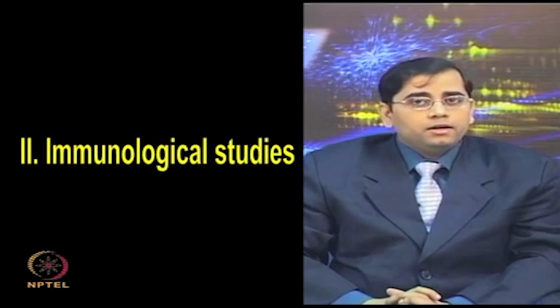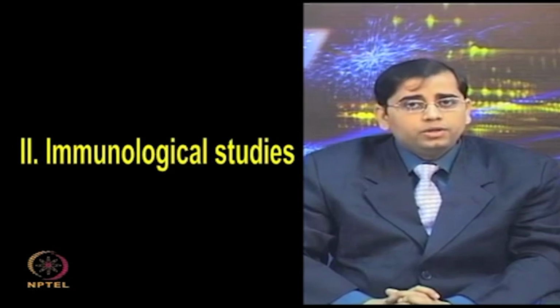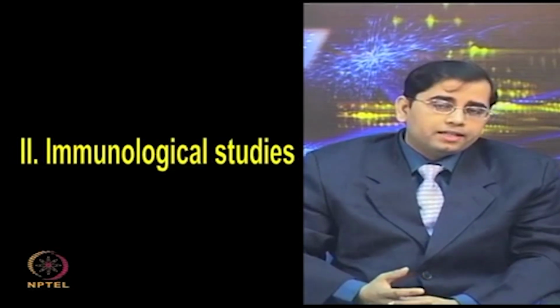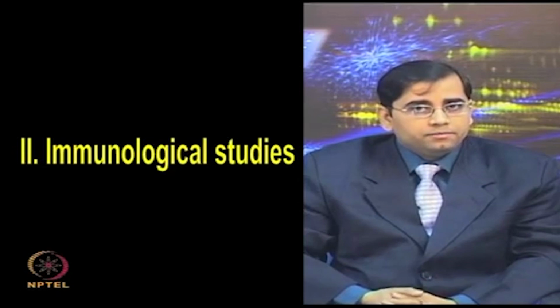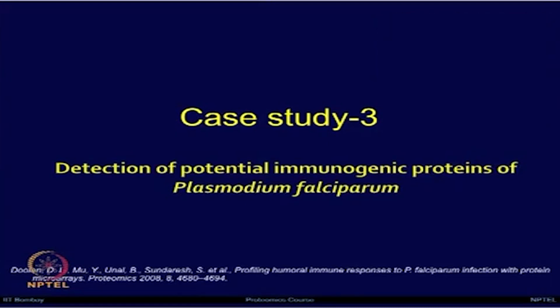Let us now move on to another application, immunological studies. On one hand, several studies have shown application of protein microarrays, including cell-free based protein microarrays, for biomarker screening. Several studies have also focused on immunological studies. This is case study 3, detection of potential immunogenic proteins of Plasmodium falciparum, a study performed by Doolan et al.